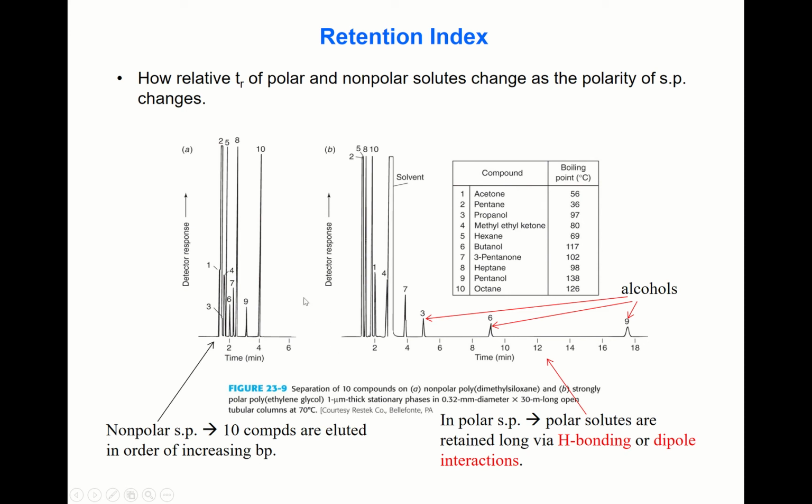For example, compound one and compound two are eluted first.